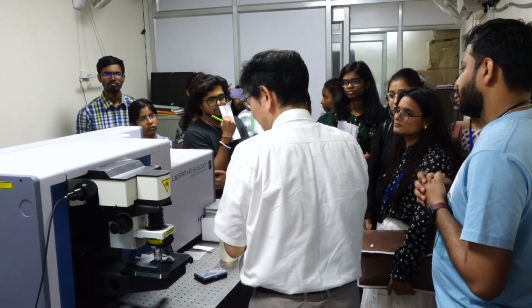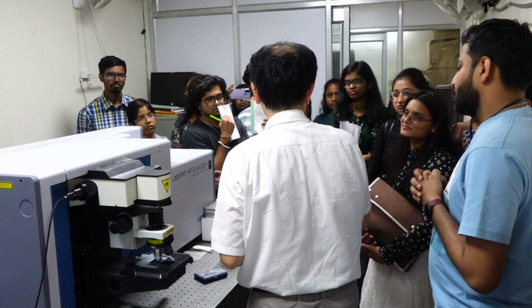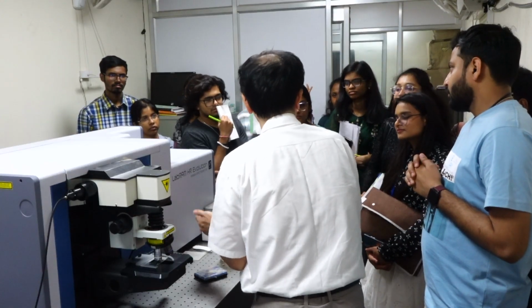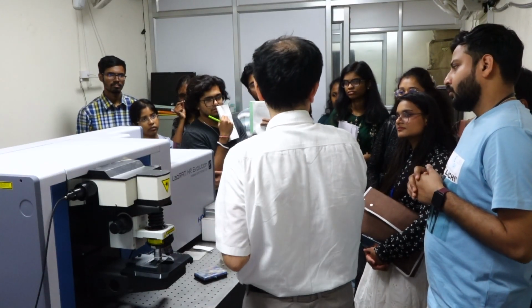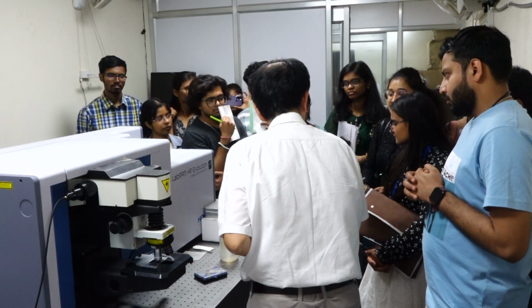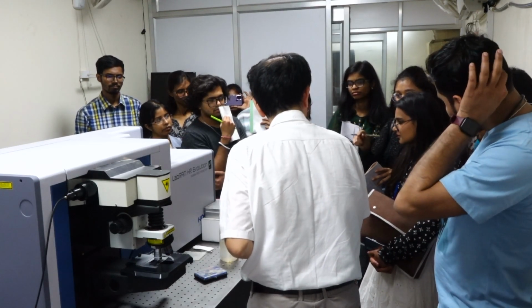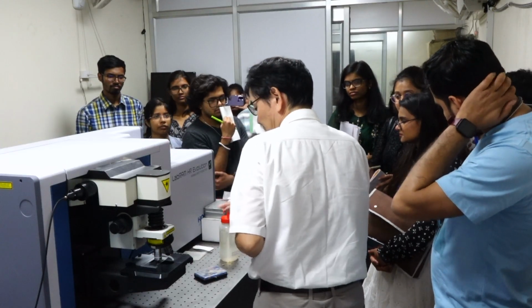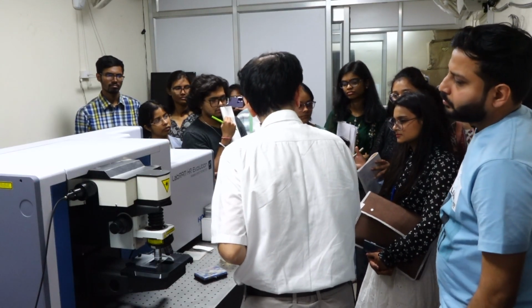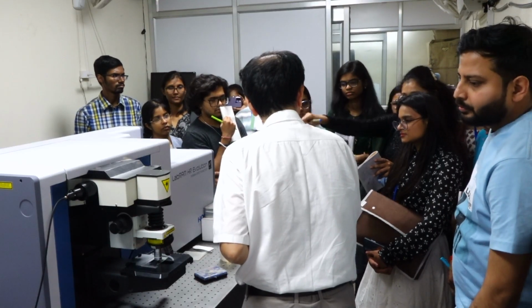It's a good question. There is almost no optical element that enables the correction of the entire solid angle. That's why we are focusing on a single plane. That's why we are doing signal correction at the start only. Right, so that the maximum amount of light or the different wavelengths of light can pass through this system.